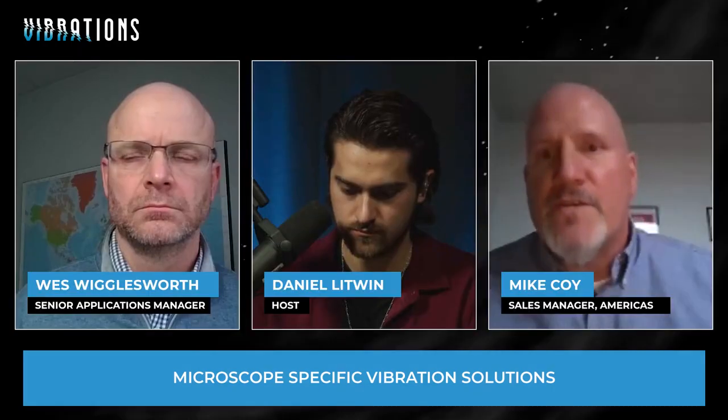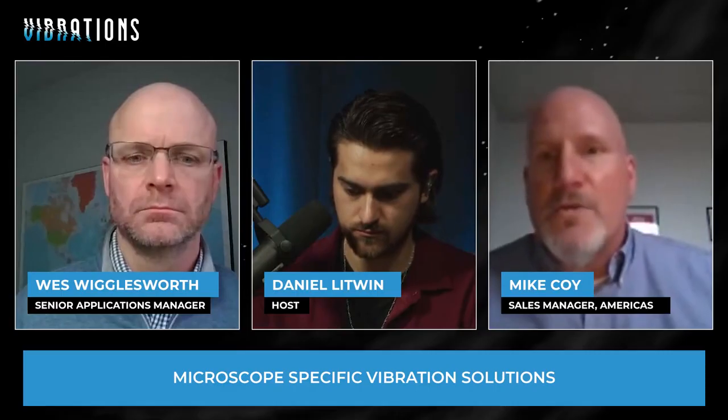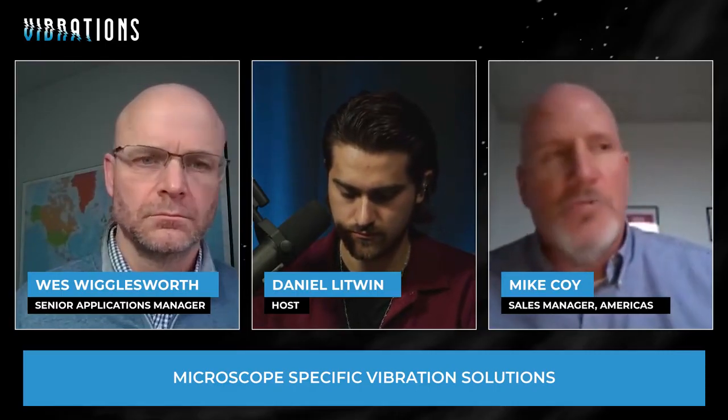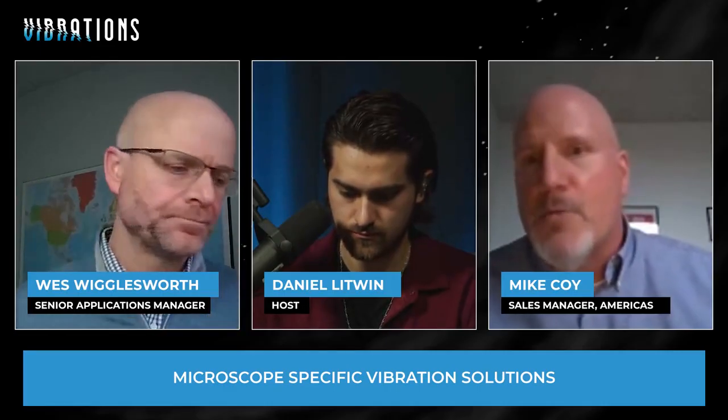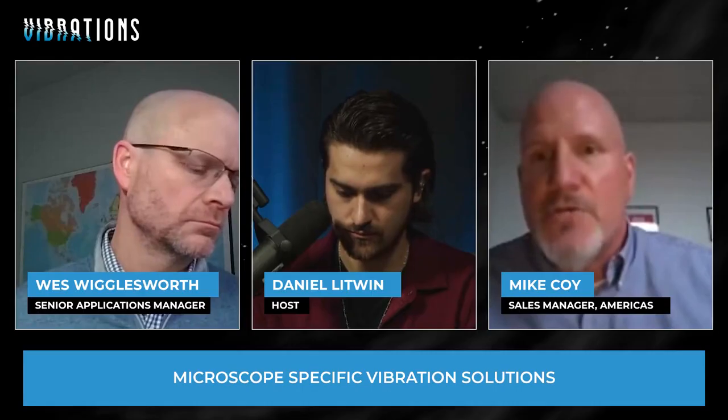And as these instruments get better and better, our customers keep finding more and more applications to chase after, and that makes it even more complicated, right? So suddenly now we're trying to do a material analysis at an interface in a 2 nanometer semiconductor structure. Not only do we need to be able to magnify in to see this structure, we also have to keep things stable while we run, say, an X-ray map to understand the composition of what's happening.